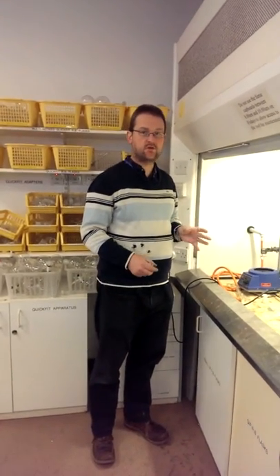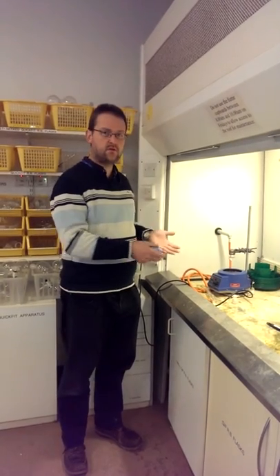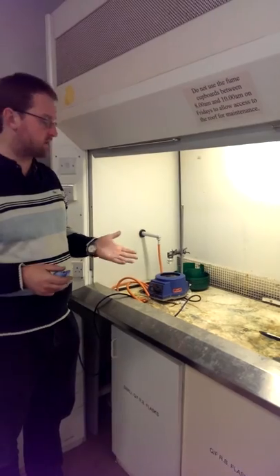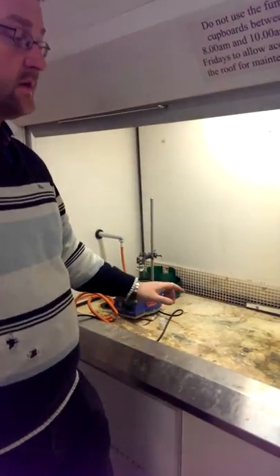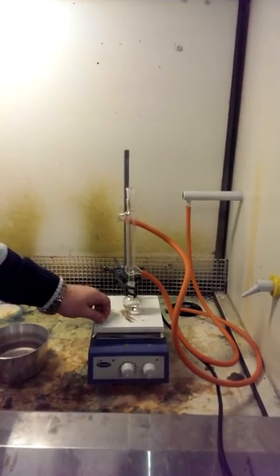So this demonstration shows you how to reflux. I have two stations set up here to show the two types of how to reflux, either by a heating mantle or a hot plate stirrer, a mechanical hot plate stirrer.